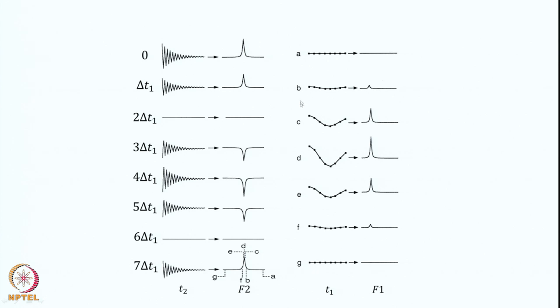So, what we have got here therefore? This is also an FID. And like here, where the FID was going point by point, showing variation, these ones are also FIDs. These FIDs are different depending upon which portion of this frequency spectrum you are looking at. Therefore, I can do a Fourier transformation along this time axis now, right? This is the time variable T1.